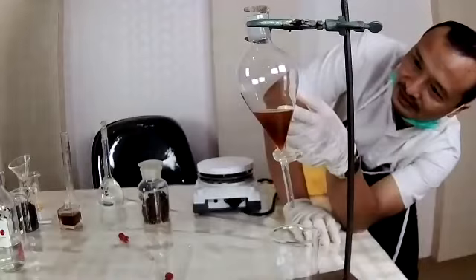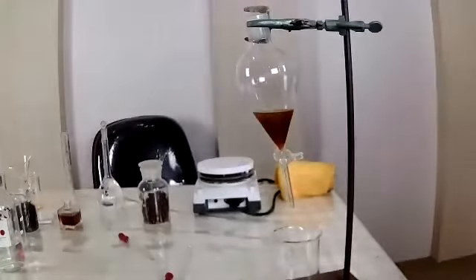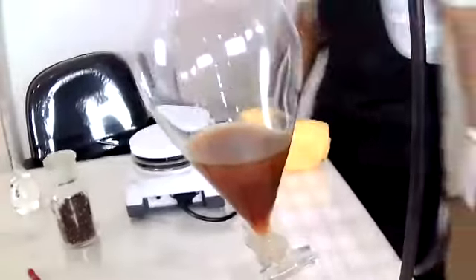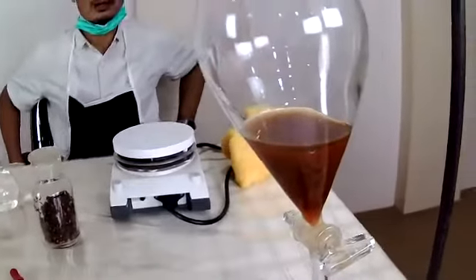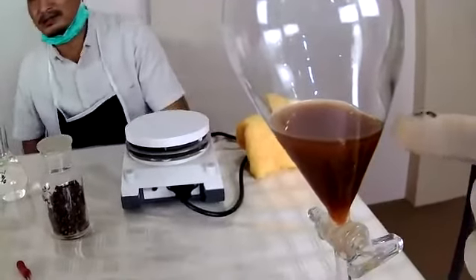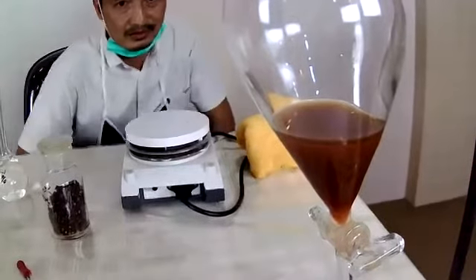You can see the separation has started to happen. You can see the separation between the soluble and the insoluble.